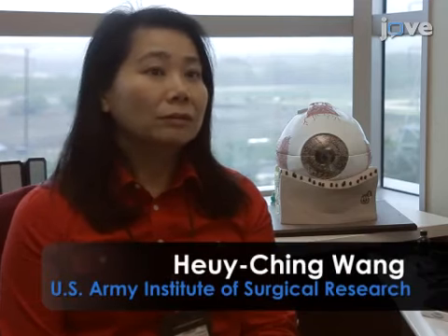Generally, individuals new to this method will struggle, because stem cells are very delicate and subtle changes in their handling can affect the differentiation process. Visual demonstration of this method is critical, as the embryoid body harvesting step from the microwell plate is difficult.